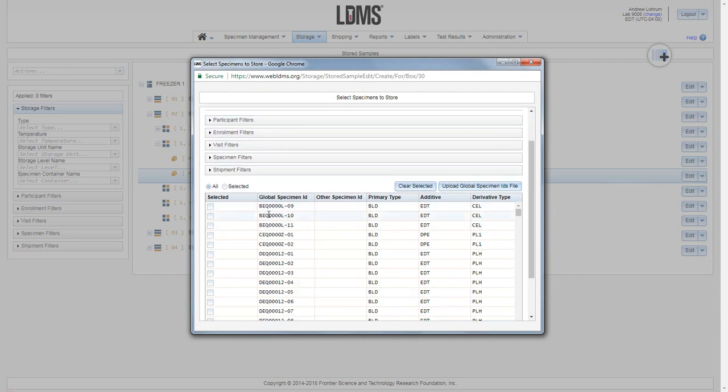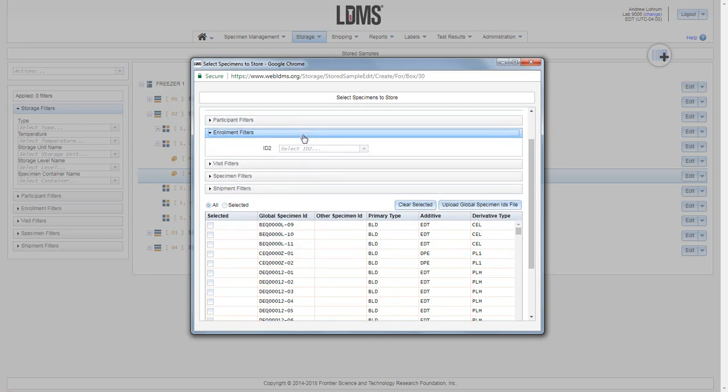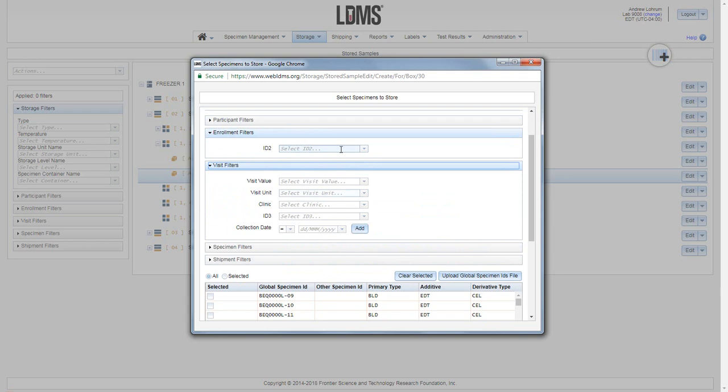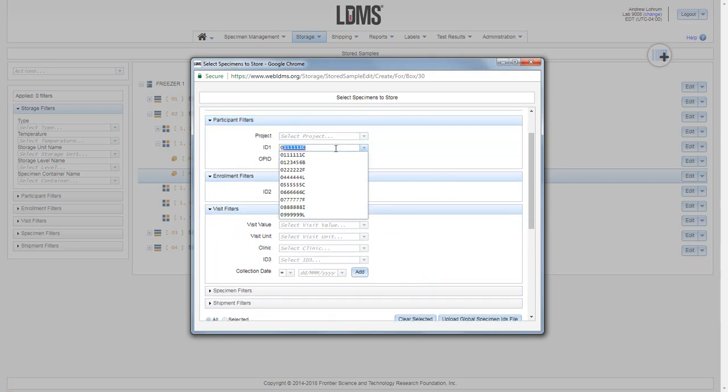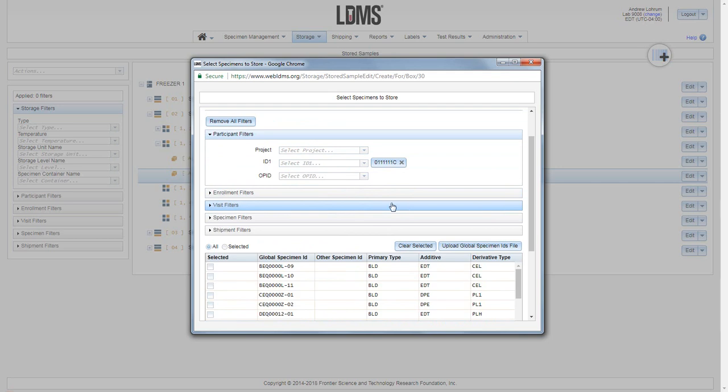Below our filters we see a list of specimens available to be added to the box. Now we can filter this list by applying the filters above. As you type, all of these filters are self-filtering through the menu and you can choose. So we have applied one filter.